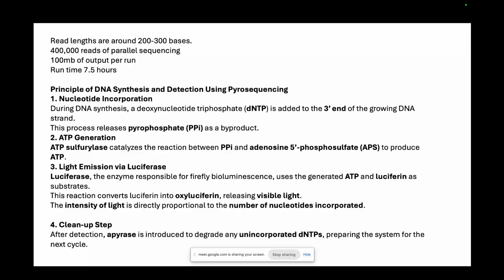So how is the signal seen? If you have A, there will be a peak. If there is T or anything else, there will be no peak as you move to the right. And again, when there is A, there will be a peak. Now, what happens if there are multiple A's, one after another in a long homopolymer stretch?